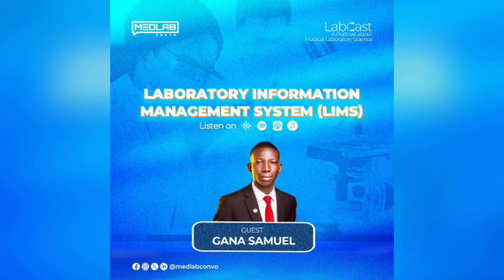Number two, when we talk about sample management system, we are looking at what happens to the sample from collection down to release of results, down to storage of results, down to anything that can happen later on. Okay, you did this test on the 24th of whatever year, and we need you to bring out the sample. All facilities should be able to have that, and this is one major thing that LIMS can give.